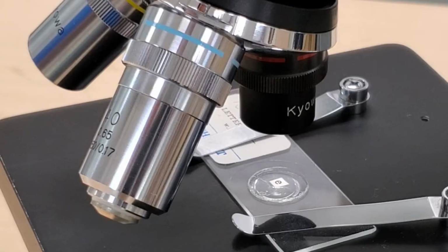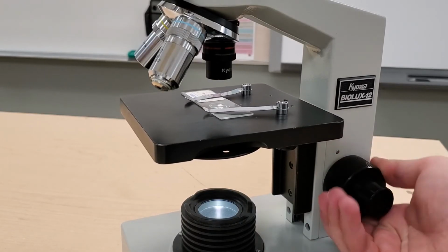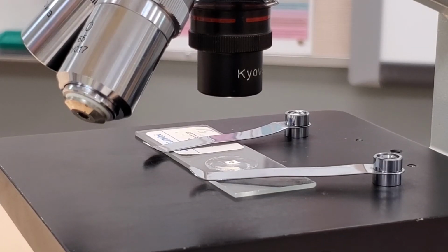Once you have the sample in place, you can look through the eyepiece and you should see your sample, although probably not in focus. Turn the coarse focus adjustment knob to raise or lower the stage and bring your sample into view or into focus.